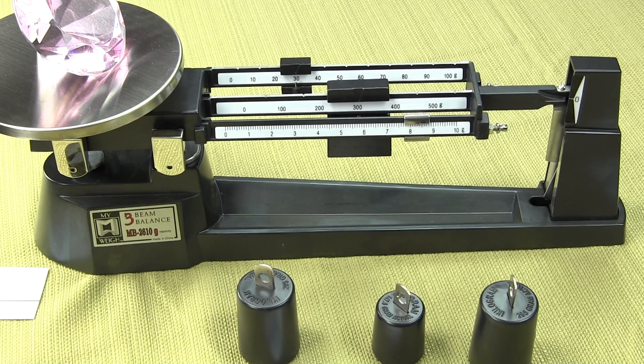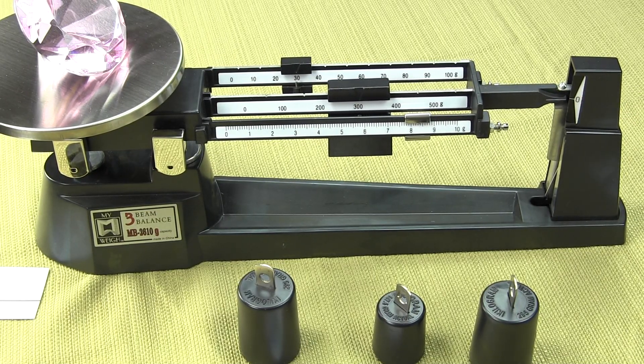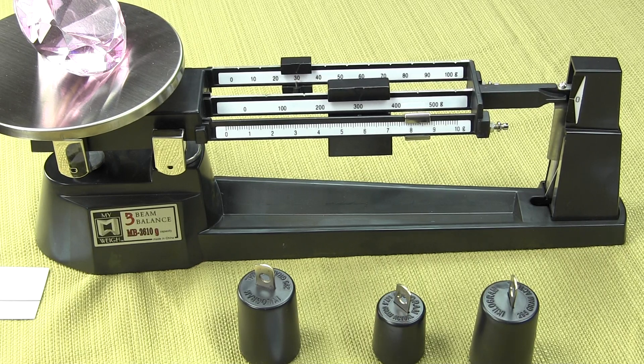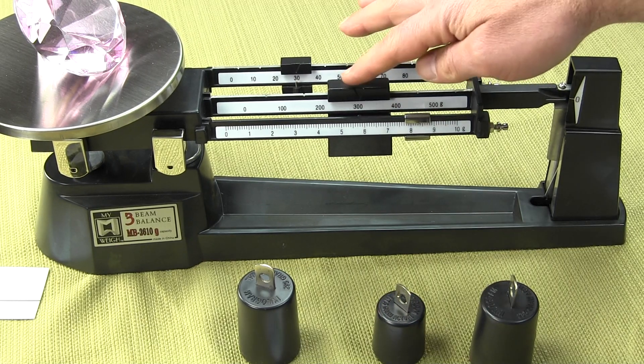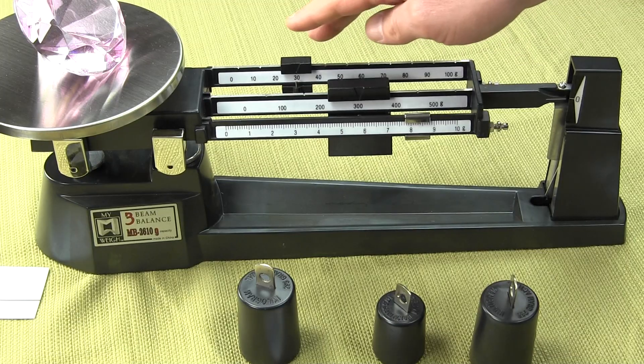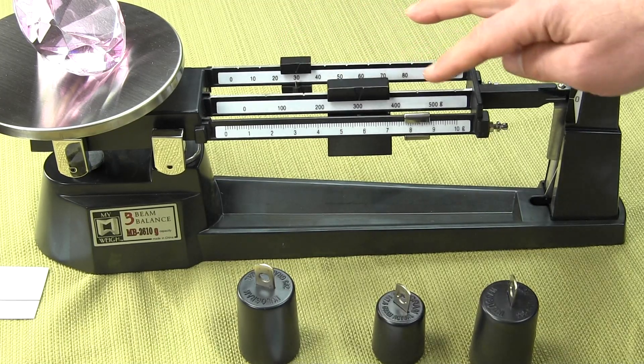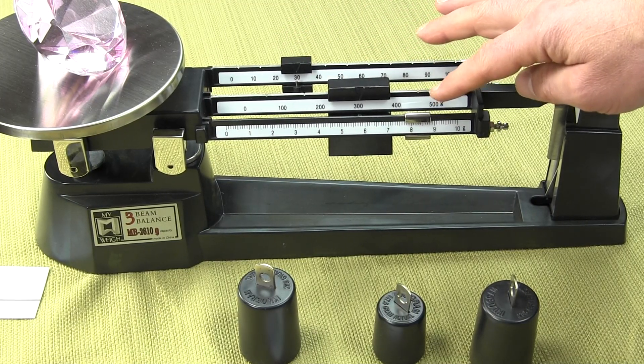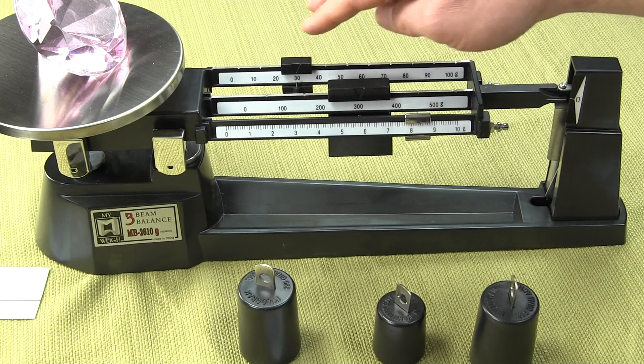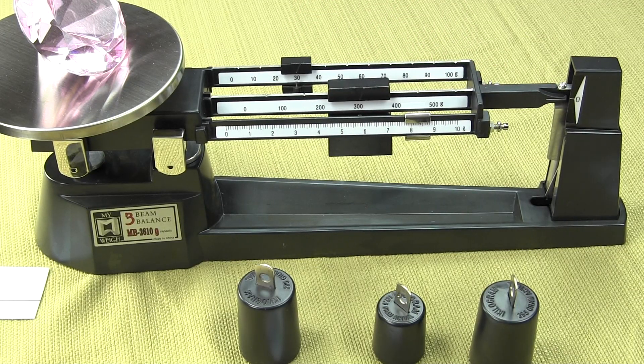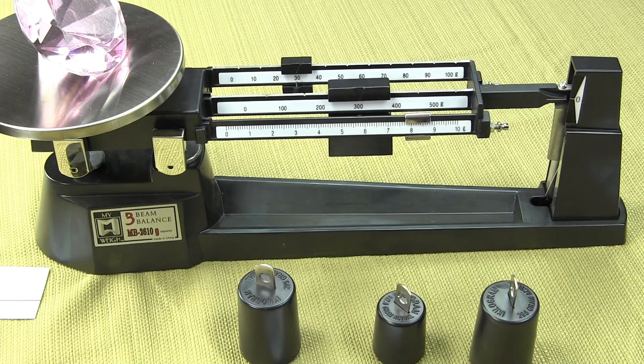Once it's level, the way we figure out what the weight is, the two hash marks are meeting each other. We want to add the middle poise which is 300, the rear poise is 30, and the front poise is 8.2. So we would have 338.2 grams. That's what that object weighs.